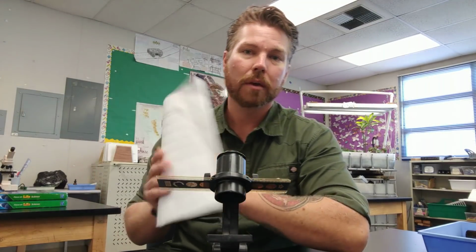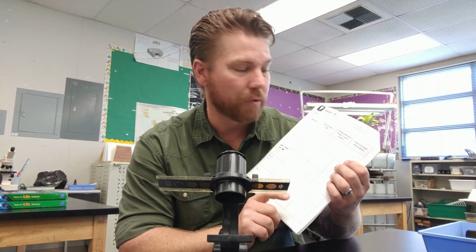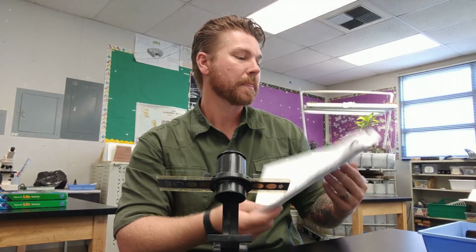The last thing that I want you to look at, because there's one more row, is sand. I'll have some sand for you. I want you to make a wet mount slide. You know how to do that. Use the microscopes, and same thing: are there cells present? Is it something living, or was it ever living? And draw it, label it, make your observations.